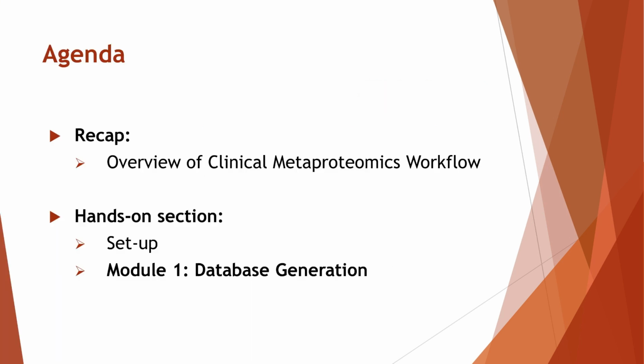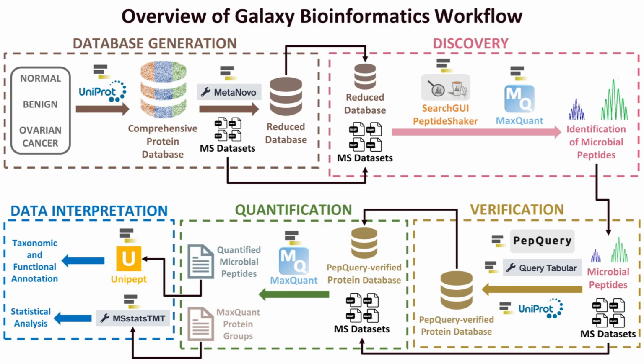The agenda for this video includes a recap of the Clinical Metaproteomics tutorial, as well as how to set up for a module, followed by the main focus of this video, executing the database generation workflow. In the previous video, I gave an overview of the Clinical Metaproteomics tutorial, but I will give a quick refresher here. As I mentioned, this video covers the first module, Database Generation.